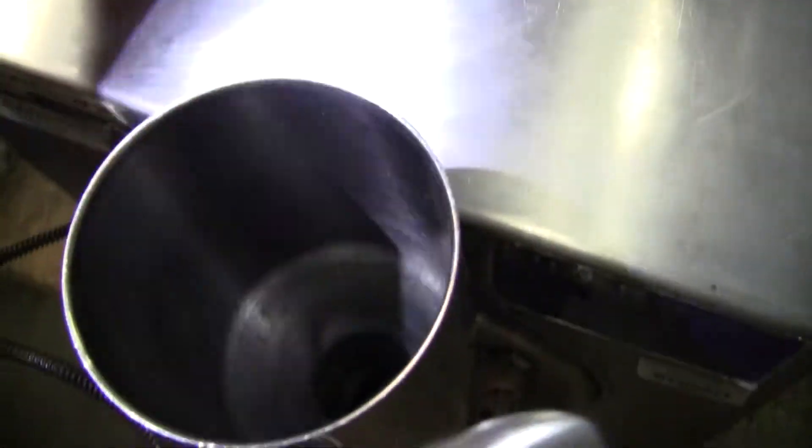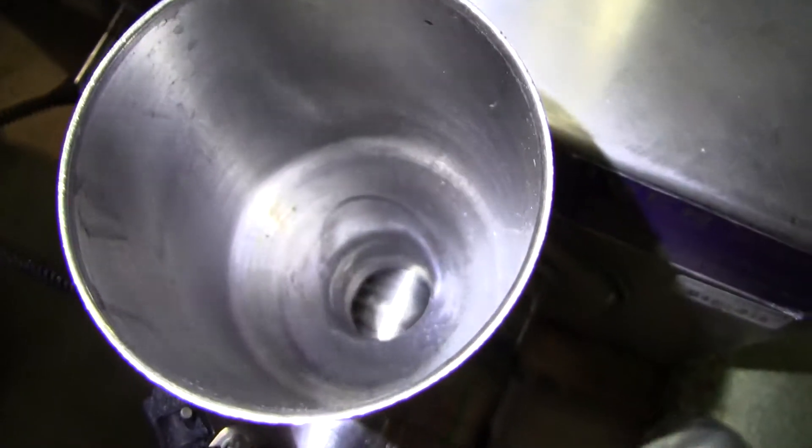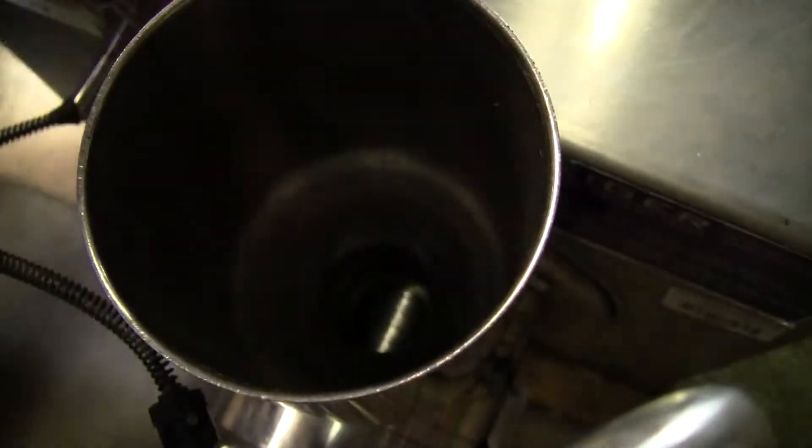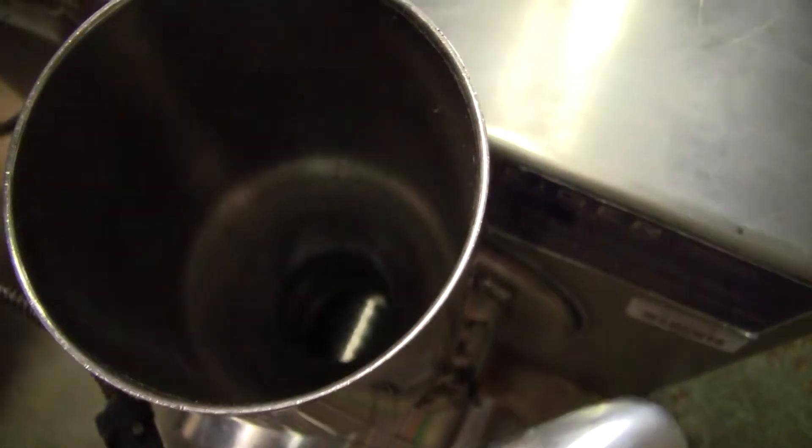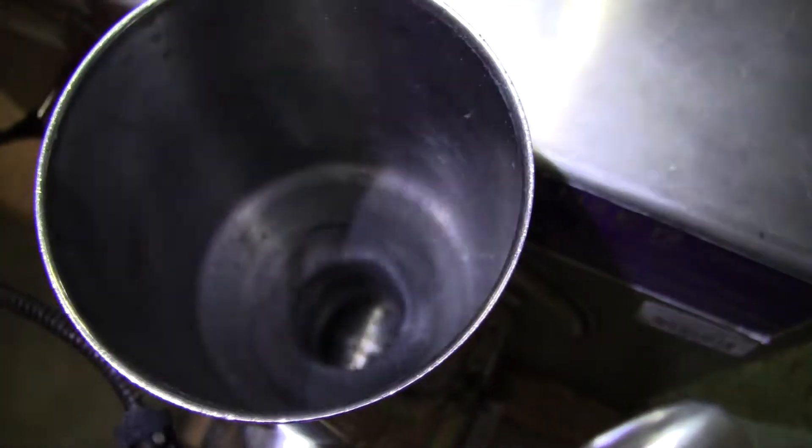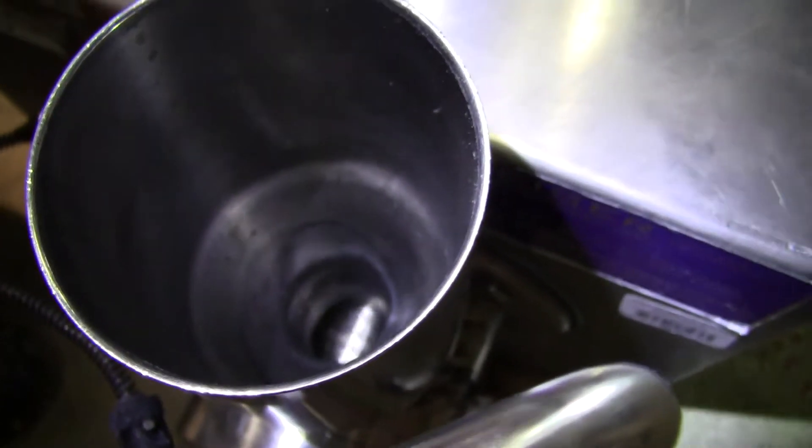You can start to see it come quite fast as I slow it down again. I can vary the speed of it. Sounds very nice.